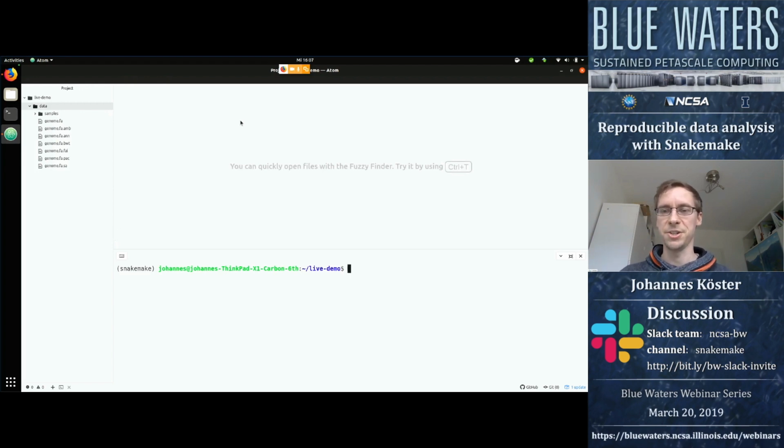Okay. So what is the setting? The setting is that we are in genomics, where we are trying to assess the genome of one or more patients, for example, in order to determine what kind of tumor they have or something like that. And for this, there exists a technology called sequencing, DNA sequencing, which allows you to retrieve small snippets of the genome of a patient.